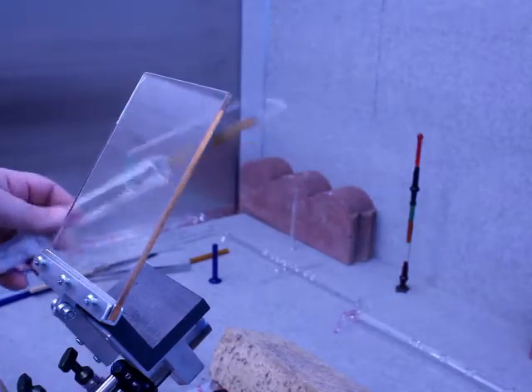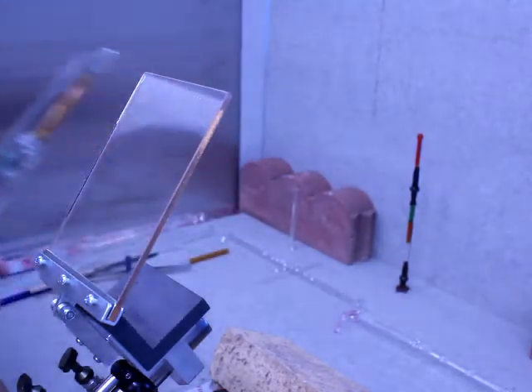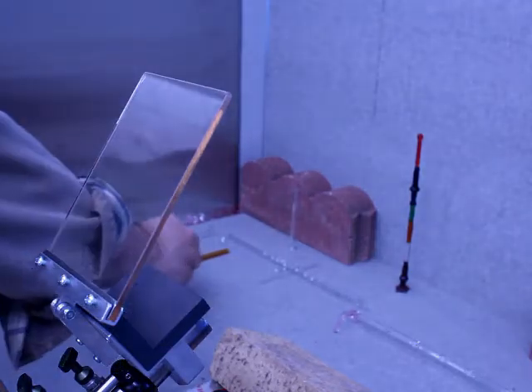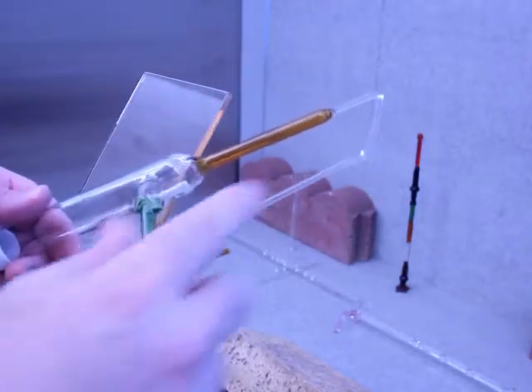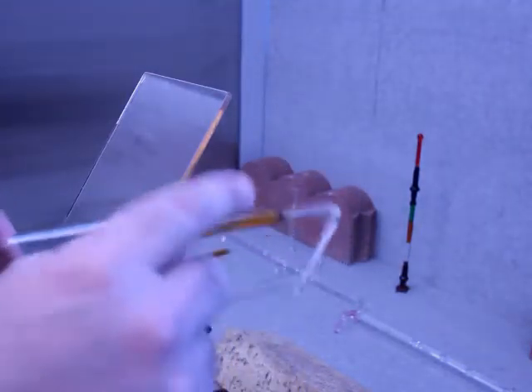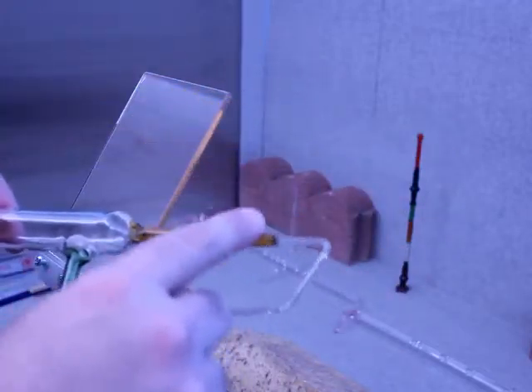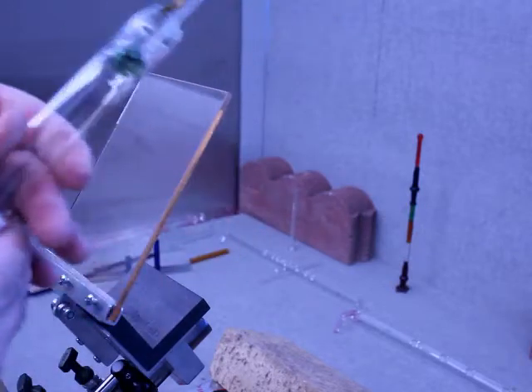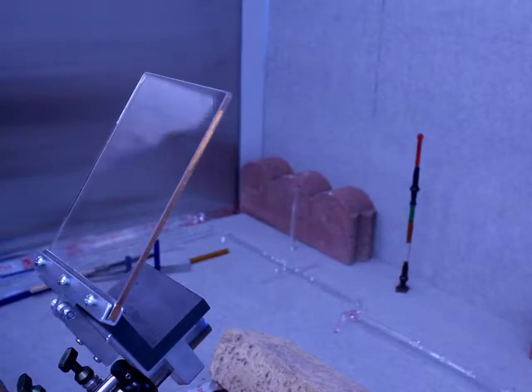Before I make my ring seal, I have to do two things: remove the bridge and open up this tube, not yet, I take that back. This tube can remain closed for now because I have my blow hose. That'll come later, but I definitely need to remove the bridge.